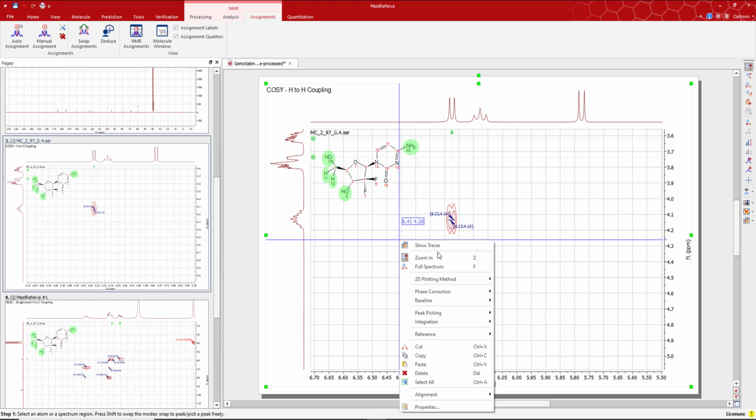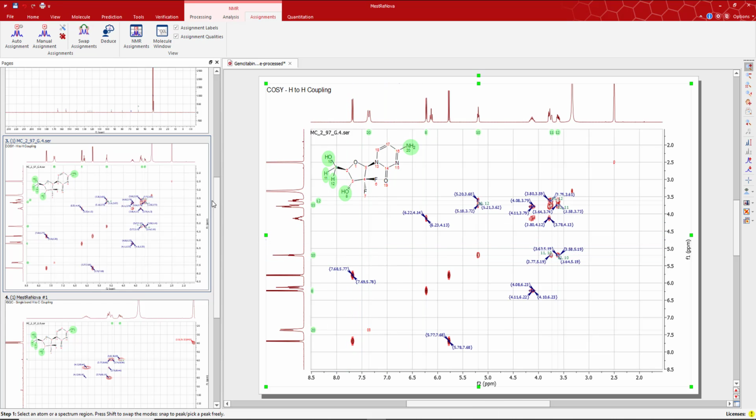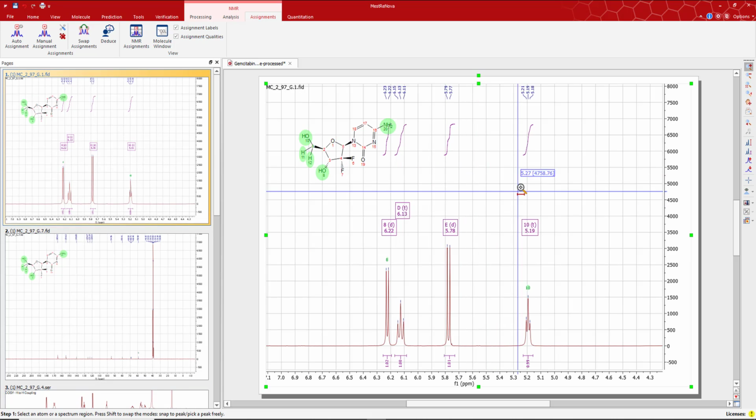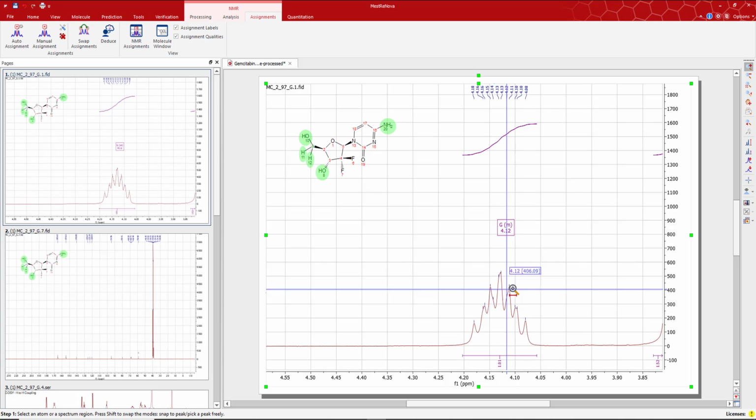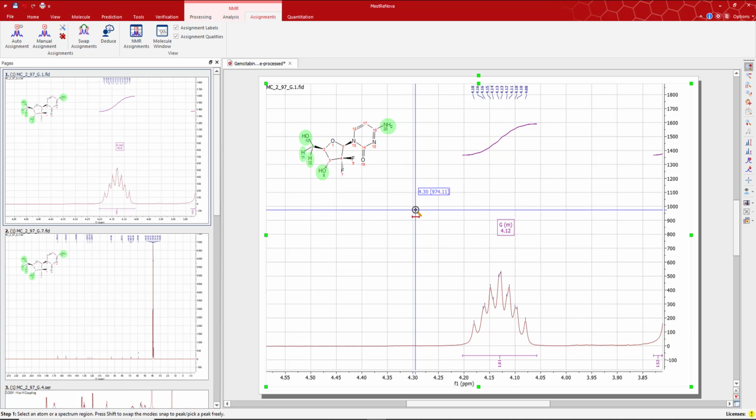It looks to be a fairly complex kind of multiplet, so let's go to the proton and take a closer look specifically at that peak. So it's this thing right here. And Nova's called that a multiplet, and if you're wondering, well, that's just a 1H with two neighbors. It's got a neighbor here and then a neighbor on oxygen. Why is it so complex?